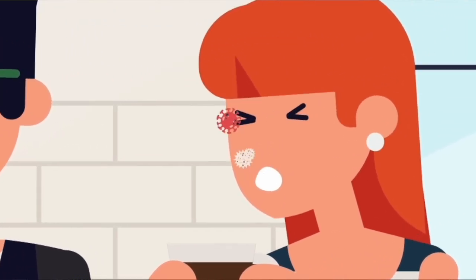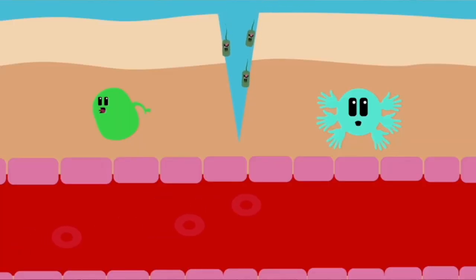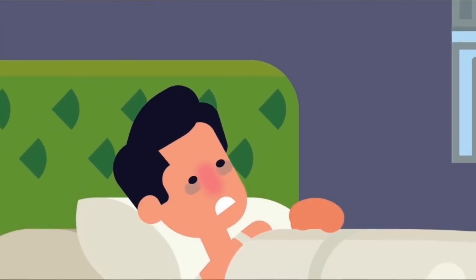And the diseases which are also associated with immunological responses, for example, different viral and bacterial infections that can cause cell activation or cytokine production. So we can measure these activation states and the related cytokine abundance, so that we can say what sort of infection this is and how critical the infection is by this technology.